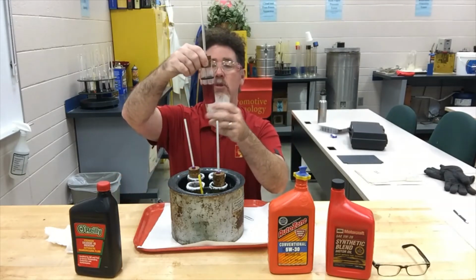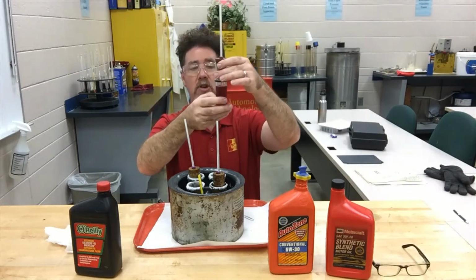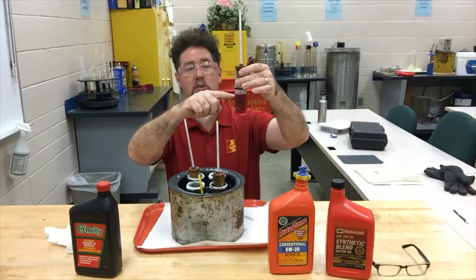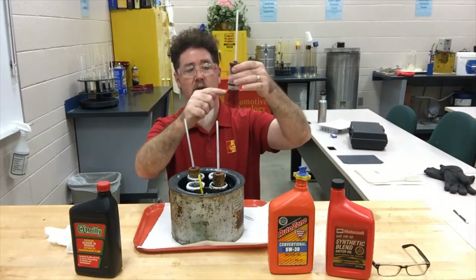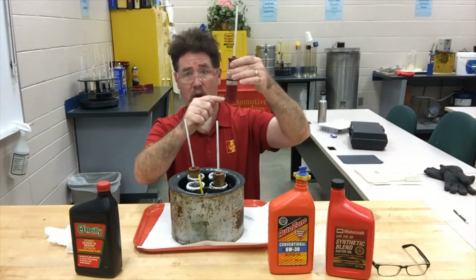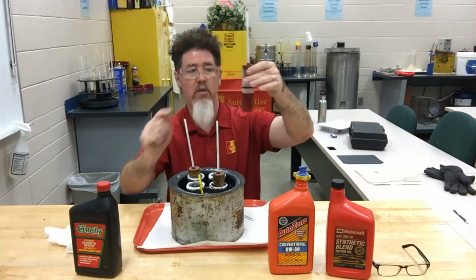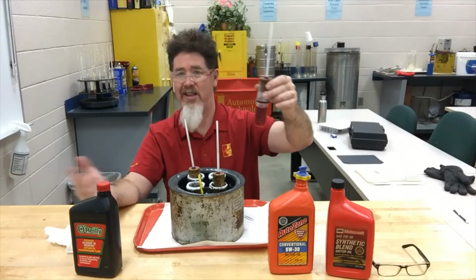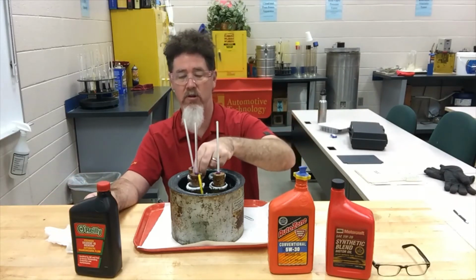Your automatic transmission fluid also started to cloud at 0 degrees, at the bottom. I moved the thermometer to the top to measure pour point. We're right now 20 degrees above 0 at the top, not at the bottom. We're a lot colder at the bottom, below 0, but at the top we're at 20 right now. We're going to see at what point your automatic transmission fluid stops flowing. Is it negative 20? Negative 30? Negative 40 degrees?